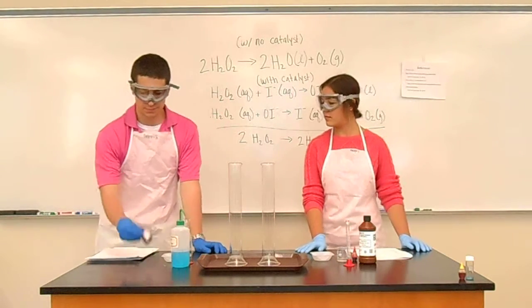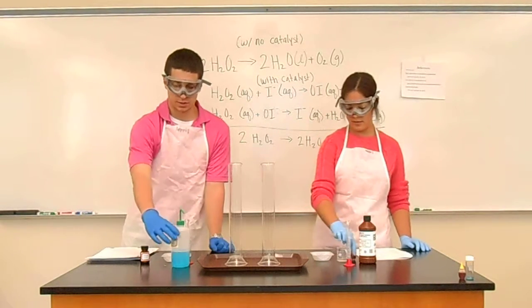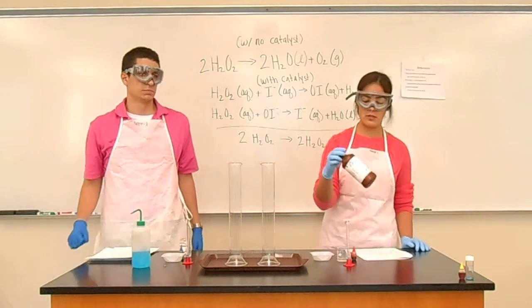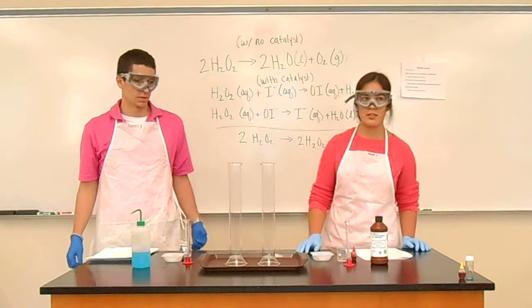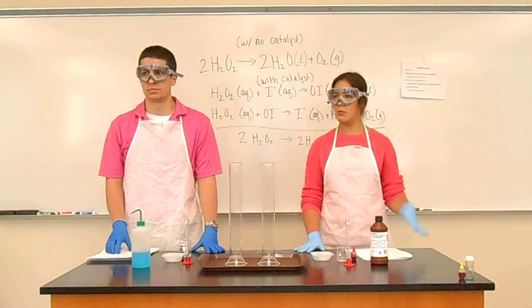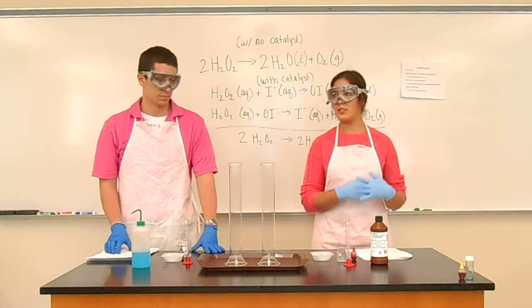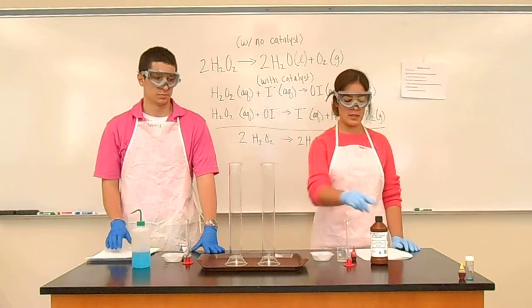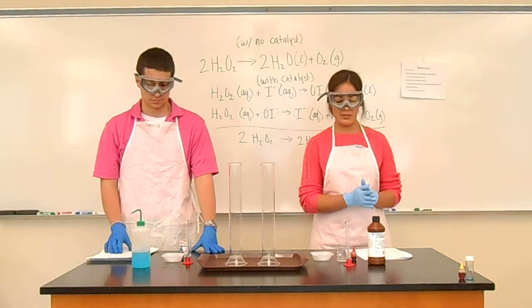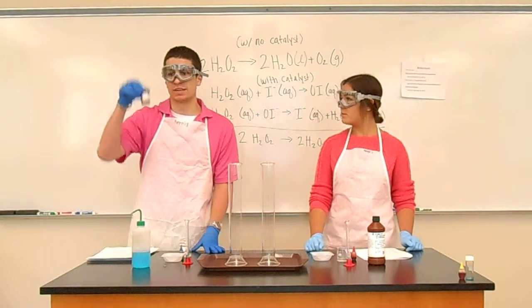We will be using potassium iodide, food coloring, dish soap, and we'll be wearing gloves, and we also will be using hydrogen peroxide. This hydrogen peroxide is actually 30%, while the hydrogen peroxide you buy at the store is 3%. So use the hydrogen peroxide from the store to clean your wounds and clean out all the bacteria, but this one can actually burn your skin, so it's really, really strong, so that's why we're going to use the gloves today.